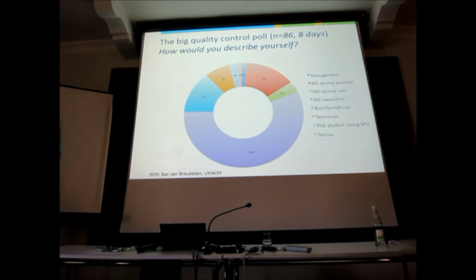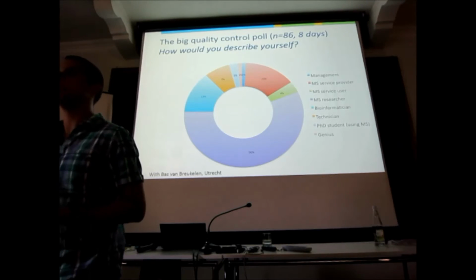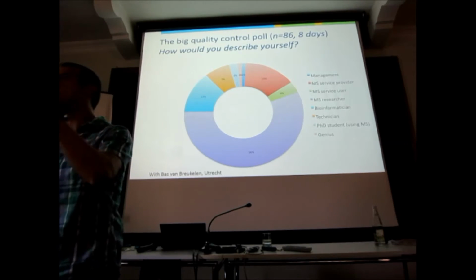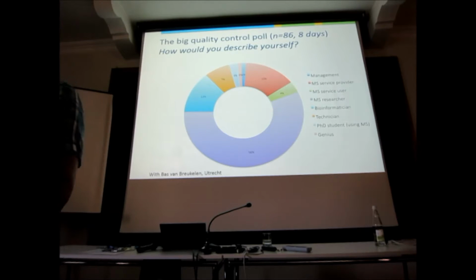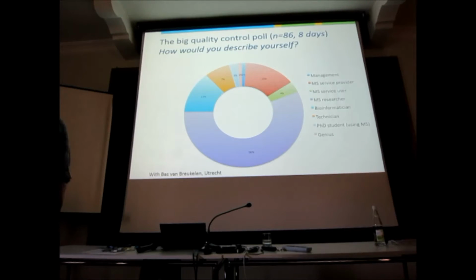Now, you're very silent suddenly, because nobody can imagine doing this in proteomics. But seriously, why not? Right? And I think the biggest problem is because you don't believe in your data. You don't believe you can do anything like that. And the reason why you don't is because you don't know how good your data is or how bad. But I give you the benefit of the doubt. And I think actually it's true. I think a lot of these modern instruments and the good protocols that we have today, we deliver quite good data, all of us. But if you don't check, how will you ever know, right? Doubt is worse than whatever comes out in the end.